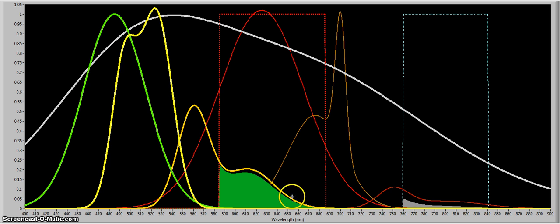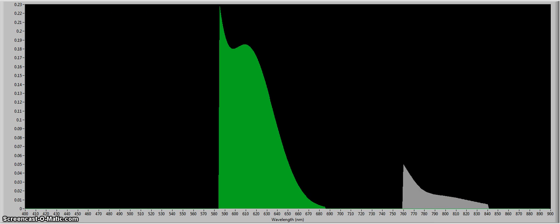So let's clear up some of the extraneous signals and just take a look at the impact on what we'd actually observe through our detector. A comparison of the area of the green channel and the red channel will indicate that there is about an 8-fold difference in the magnitude of the signal. And this will have ramifications for the ability to effectively quantify the signal resulting from the red channel.